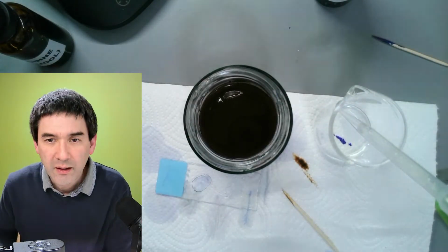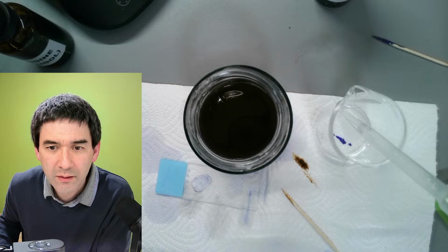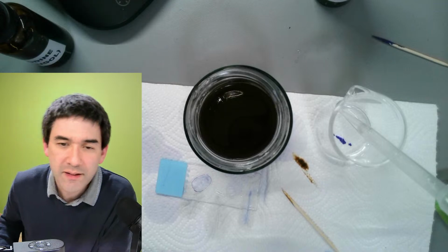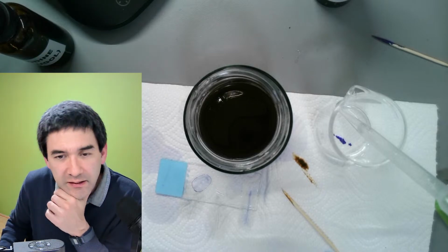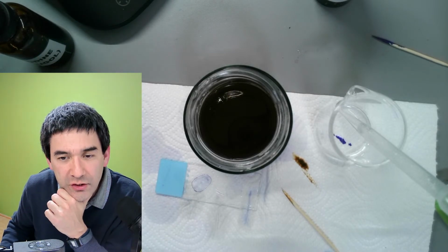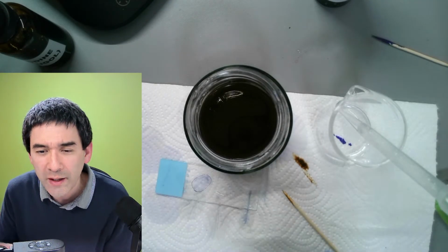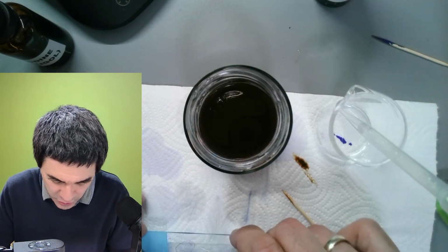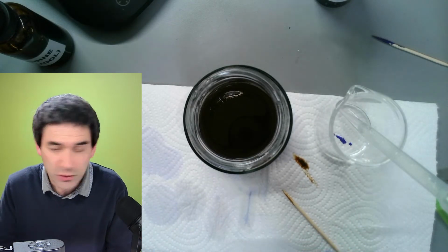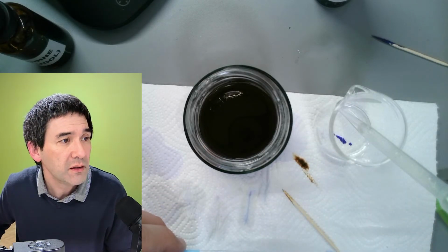I'm now going to read again some of the comments. I see Jesse's just saying it would be nice to see it under the scope after each step. I get it, that's actually a good point. I didn't think of that. But you know what? What time is it now? Let's try, why not? Now that we know how this works, maybe I'll try it again, showing it with each step. But I'll just put it under the microscope to see if there is actually a difference.